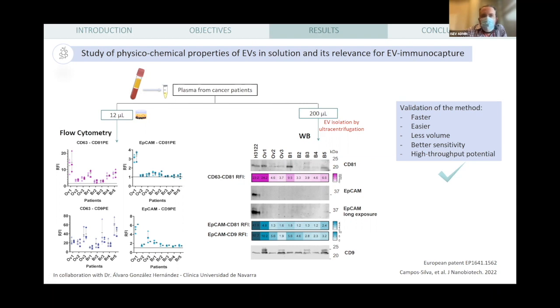Let's see, Tanina, you have a question. I do. Very nice talk. I really enjoyed it, but I have to rewatch it just to get the full benefits of it. I was just wondering if the method that you established, well, actually, the first question is: is EPCAM on the surfaces of EVs abundant as tetraspanin, or is that a rare event marker?